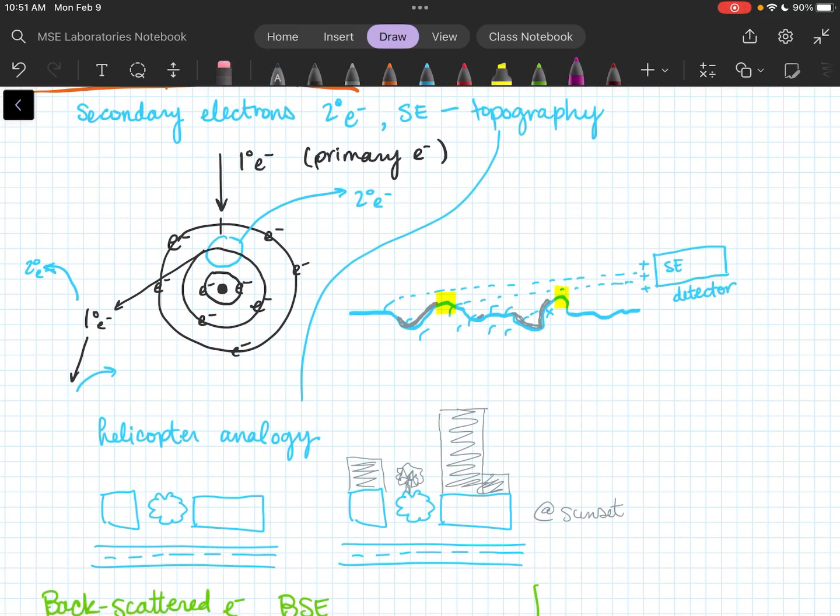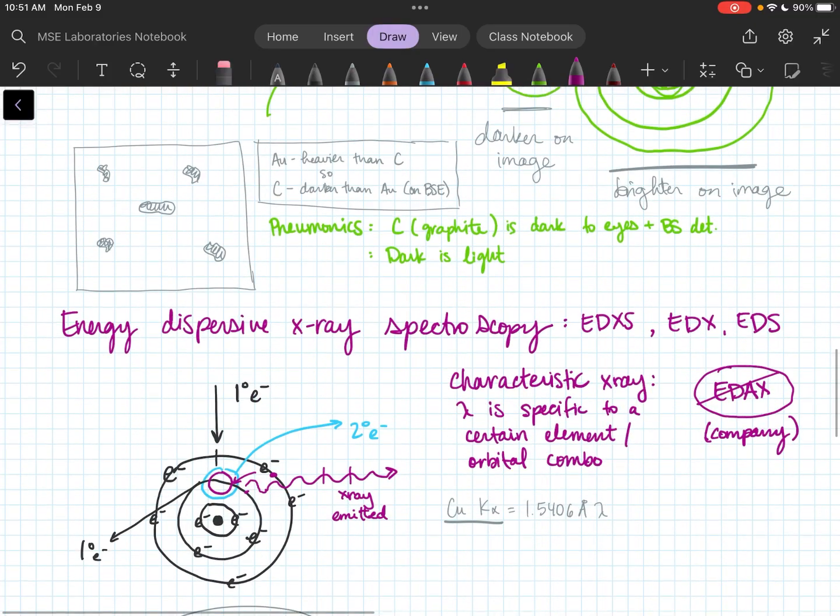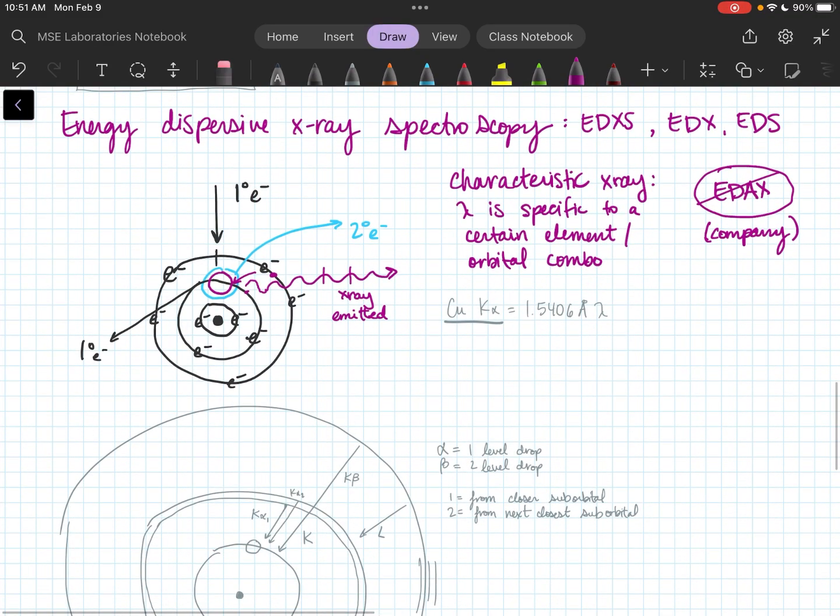I talked about how the placement of a secondary electron detector is going to give you different information, so you might have a couple of secondary detectors, all with different purposes. With this EDS detector, you can have it not care about where the X-rays are coming from, or maybe it does care about where they are coming from. Maybe it does care about what angle the X-rays are bouncing off the sample. There are a lot of different parameters that we can still study, but it's these three principles that are happening.